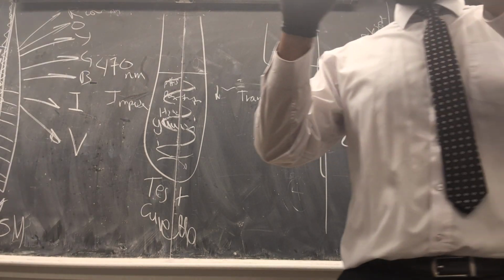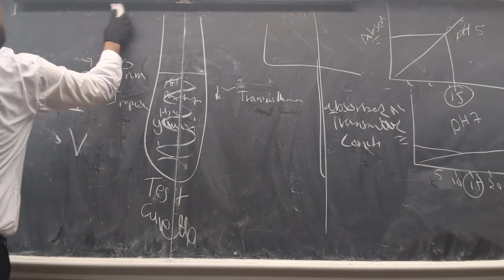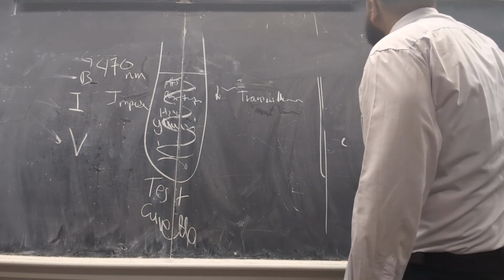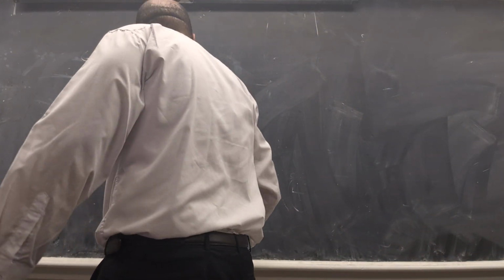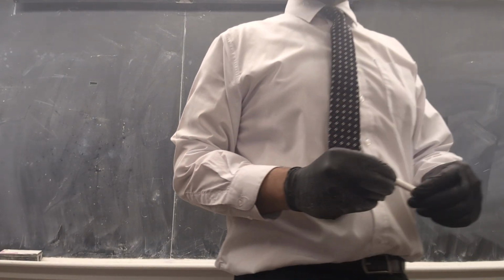Okay, all right. So we have to know where we are. When we're doing lab, we have to know what we are concerned with. So what is this lab all about? We talked last week that we cannot look at our enzyme in isolation. We have to know where exactly it falls. You know, they say you cannot see the forest for the trees. Somebody cannot see the general picture because they look at something so minuscule. So our experiment is about the enzyme peroxidase. But it's not really about the enzyme peroxidase.